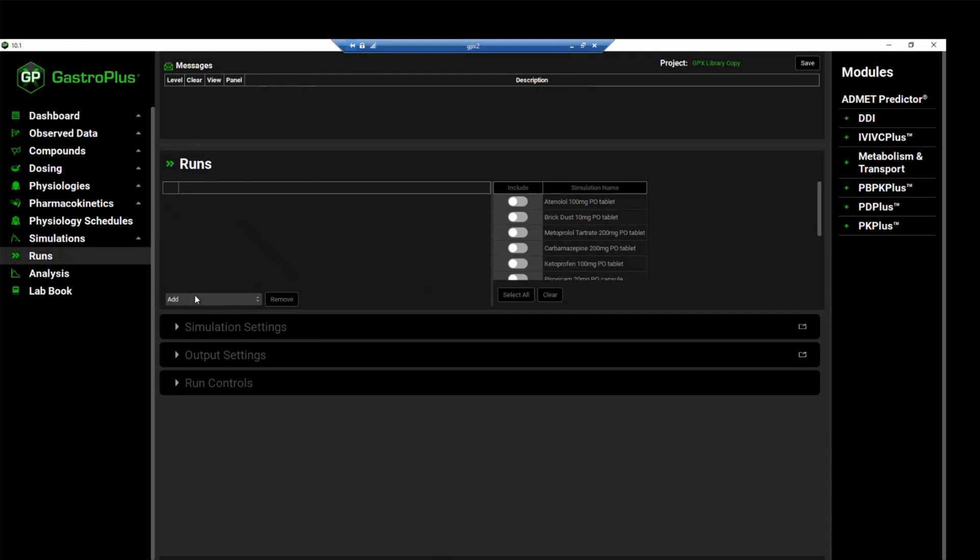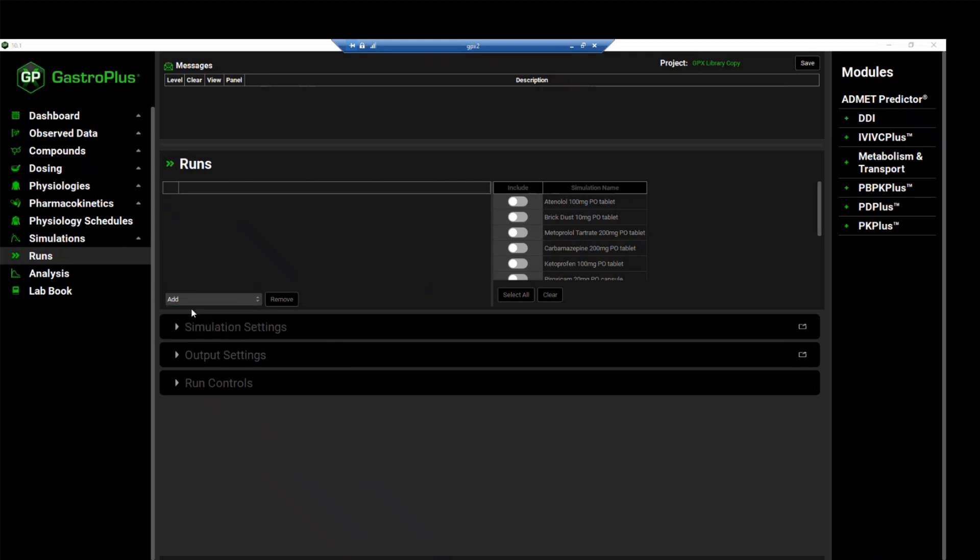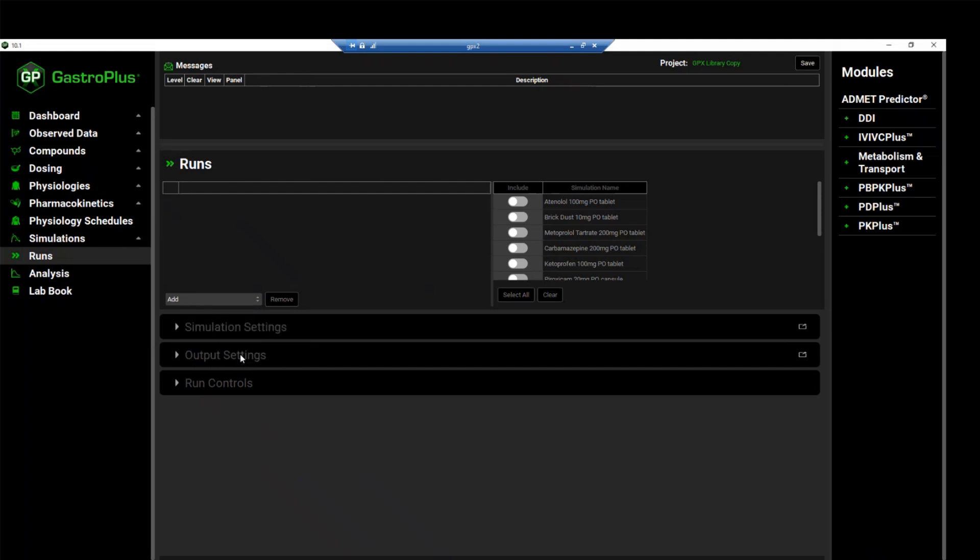To add a run, click on the add dropdown menu. From the dropdown menu, you can see that we can select different run modes that are available in GPX. In this case, we want to run a batch simulation, so we will select simulations. We can name our run PO simulations and then click OK.